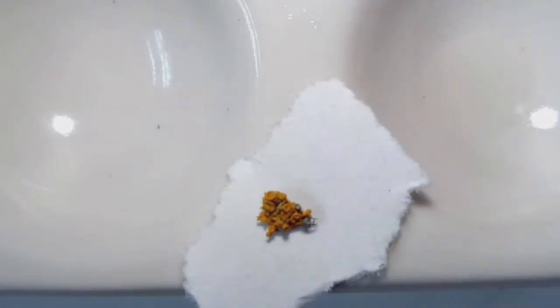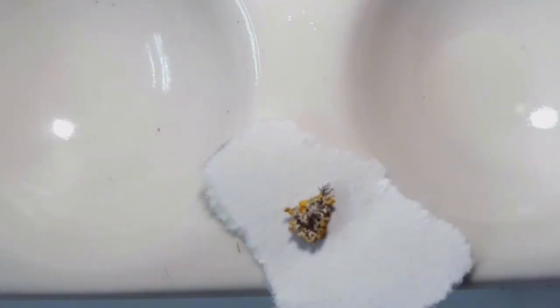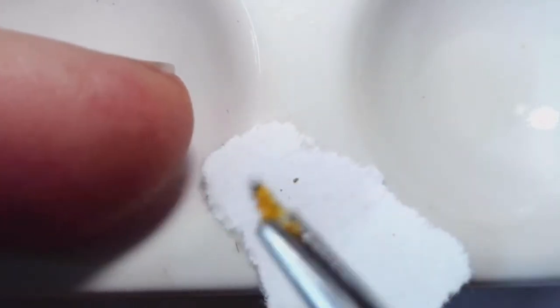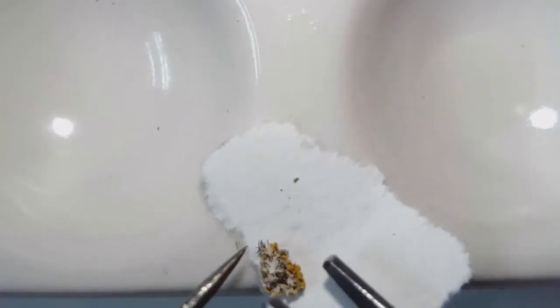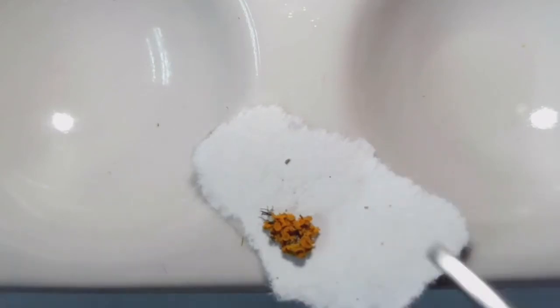And so again now, I'm going to put my little piece of paper there. I'm going to break off a piece of my lichen and put it on there. And then I'm going to get my dropper with K. And whoops, that's always the problem with working with such small things, is you lose them easily. They drop off. So I'm just going to flip this over so that we see the nice orange top. I'm going to try to anyways. Come on. There we go. Okay.